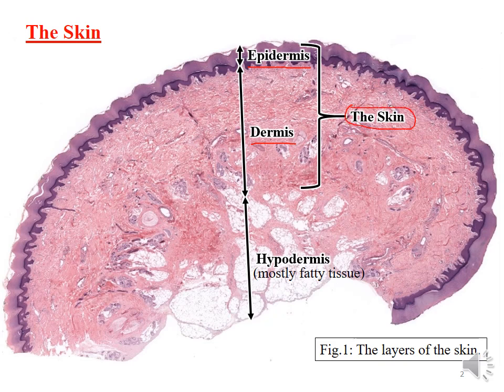So here, this is the epidermis, which appears dark stained, and the lighter stained, mostly red in color, this is the dermis. Below the skin, we have a third layer called the hypodermis, or the subcutaneous layer. This is mostly formed of fatty tissue, meaning that we have adipocytes, and as you know, these adipocytes appear white or vacant in color. So as you can see in all these parts, the cells appear white or vacant in color because mostly it is fat.